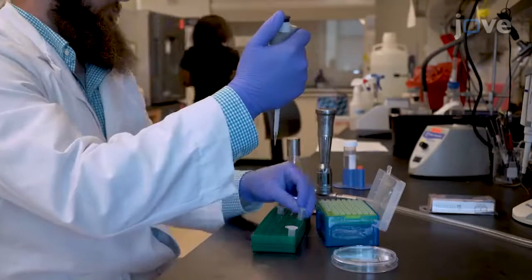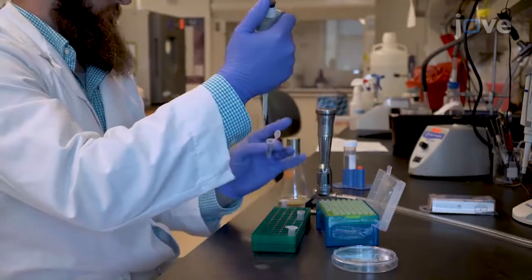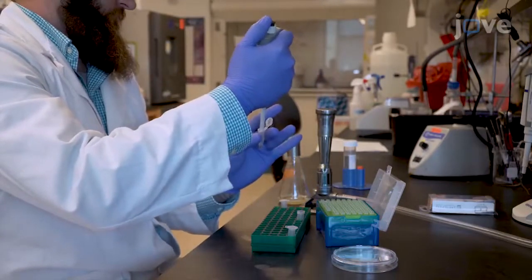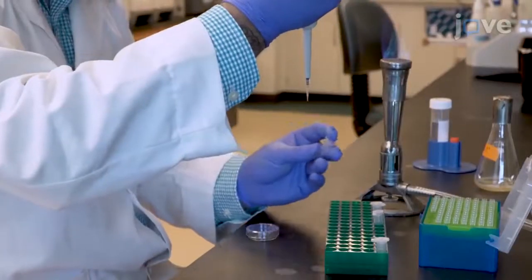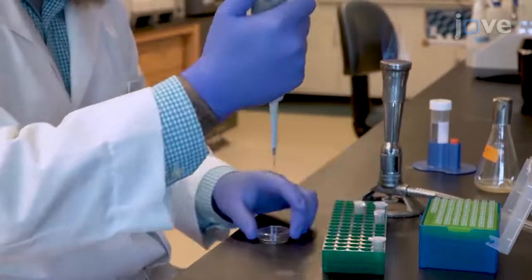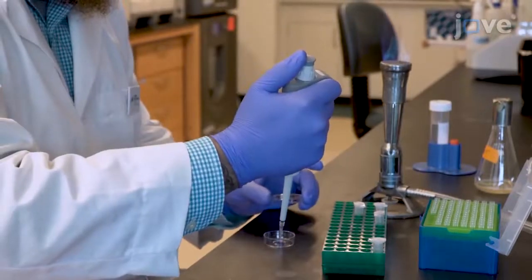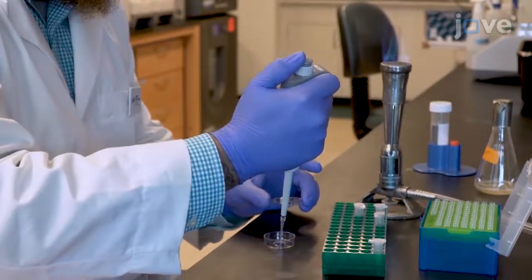Begin by labeling a 5 to 50 microliter aliquot of the cell culture of interest with an appropriate membrane staining dye and adding 5 microliters of the stained bacterial cells onto a cover slip on the bottom of a 35 millimeter glass bottom culture dish.